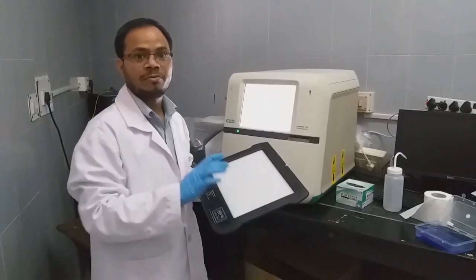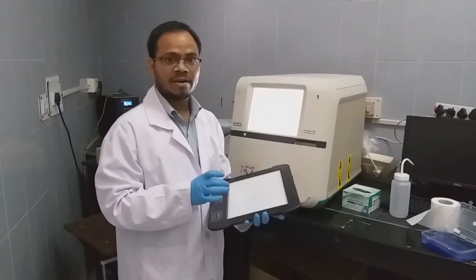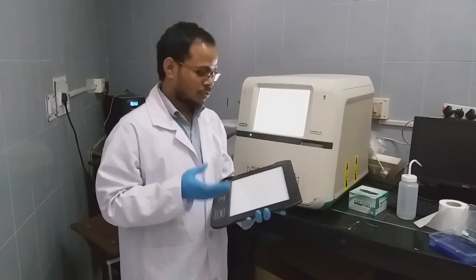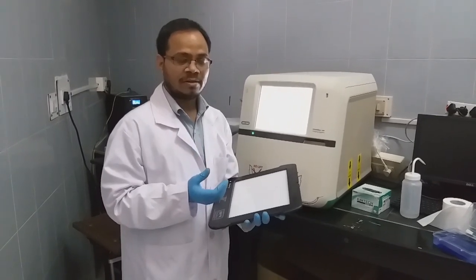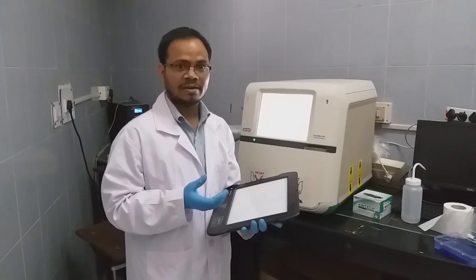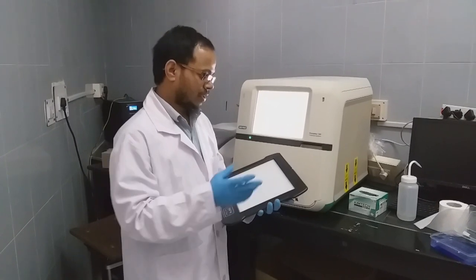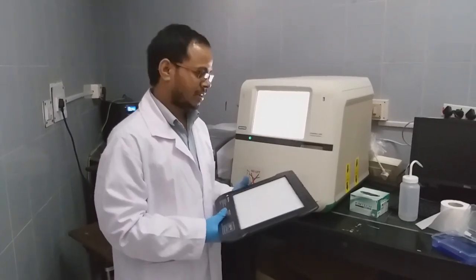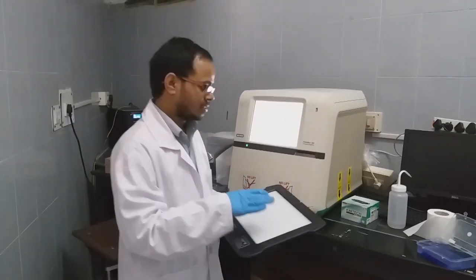Here we will use the white tray. There is another one, a gray or UV tray, also there. So there you can see any fluorescent one or stained with ethidium bromide, or blots, chemiluminescent blots, you can use that. But for normal protein imaging we can use this white tray. So I am going to keep the gel on this one.